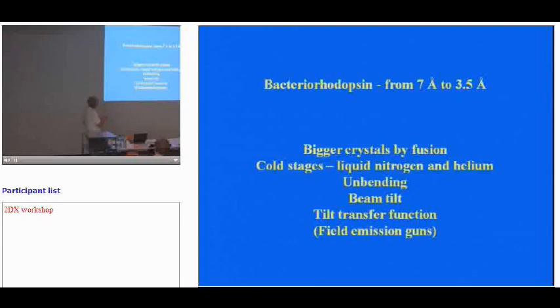So around in about the 80s, these were some of the factors, and they're still relevant for, if you've got a new protein, a new crystal, you want to know what to do. What is it that makes it better? Well, obviously, the bigger the crystals, the better. And one of the things, if you're doing electron diffraction, you do get better electron diffraction patterns when they're bigger, although there are some pitfalls I'll come to.